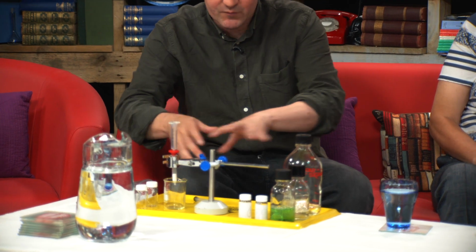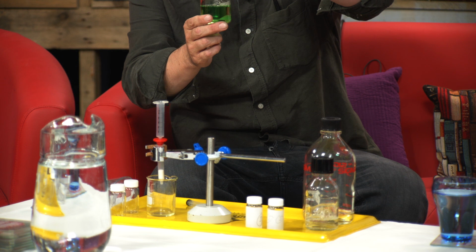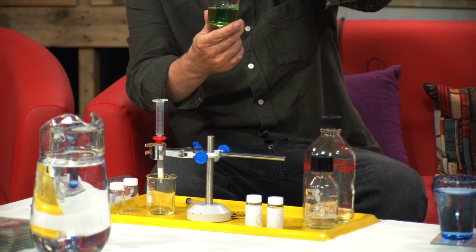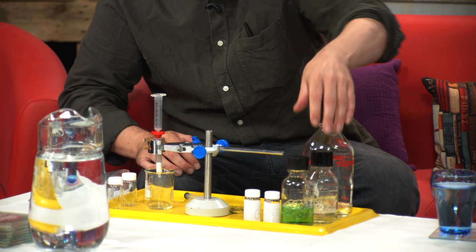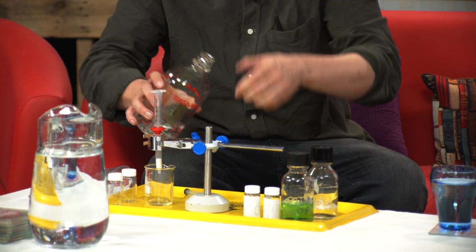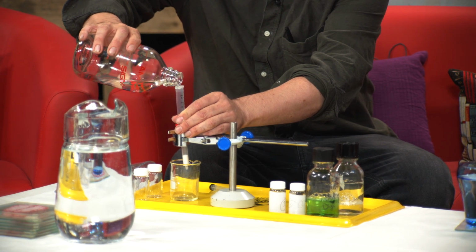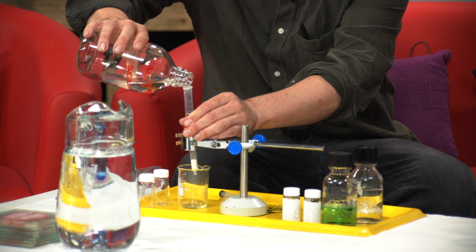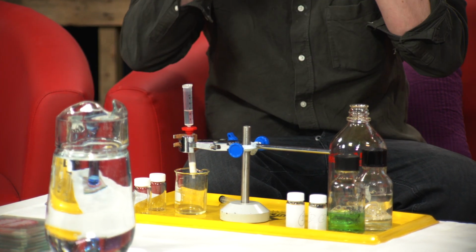Before we do the actual separation, what we're going to be doing is separating some food colouring, which is made of a mixture of two different food colours mixed together. We're going to separate it into the two parts. But before we do that, we have to prepare the column, which will take a few seconds. So I'm just going to run through the first solution. I should put my safety glasses on in a second, because it hopefully won't, but it might go everywhere.